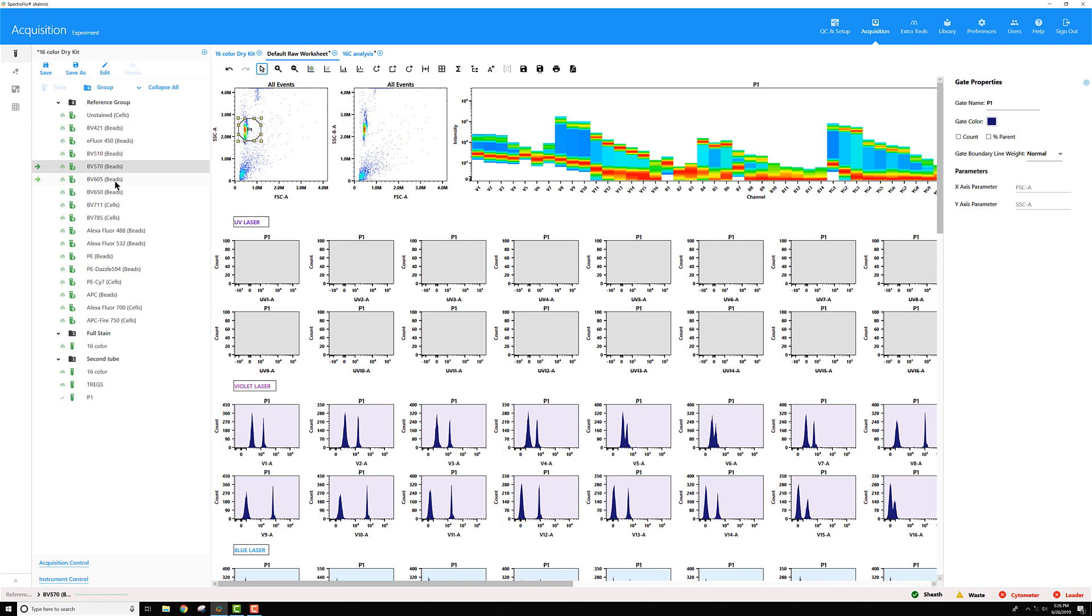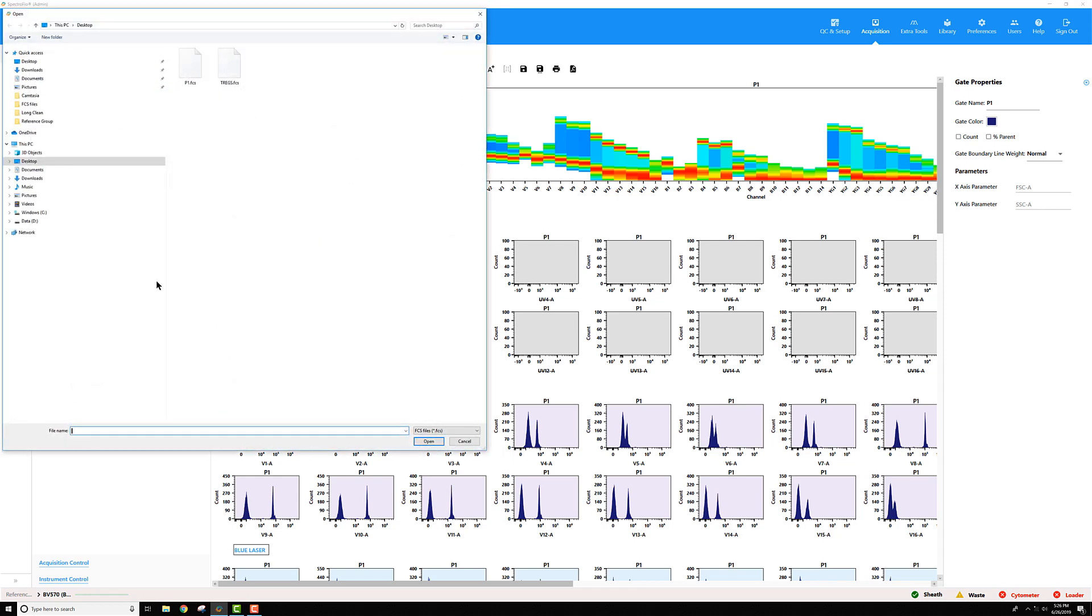So for example, if I went through that workflow for my BV570 here, I could right click on the BV570 tube, import FCS file, then select the file that I created.